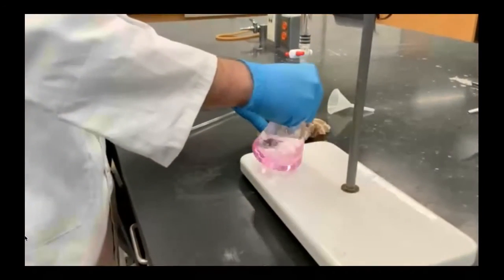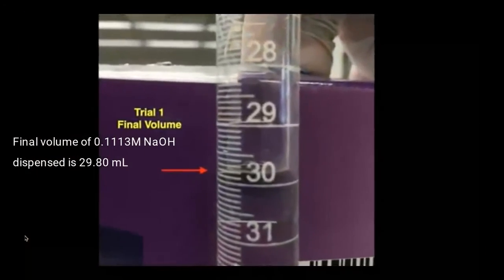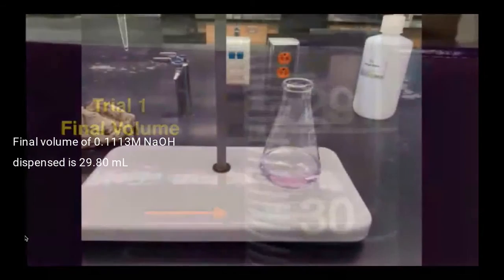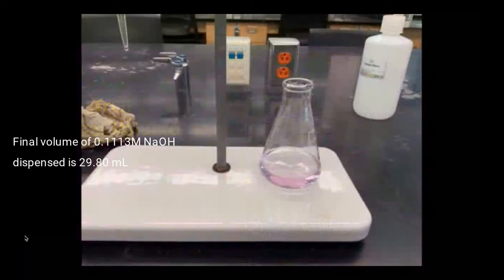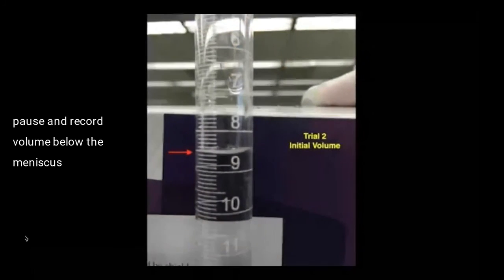Now I've titrated to a pink color and I'm going to record the final volume in my chart. After about a minute, the pink color has dissipated to a faint pink, which is what we want.